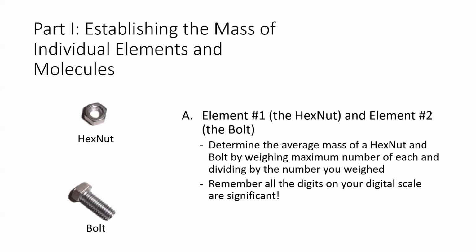Same thing with bolts. Use as many as you can. Divide by the number that you weighed to record the average mass of a single bolt. Remember to record all the digits on your digital scale because all of them are significant.